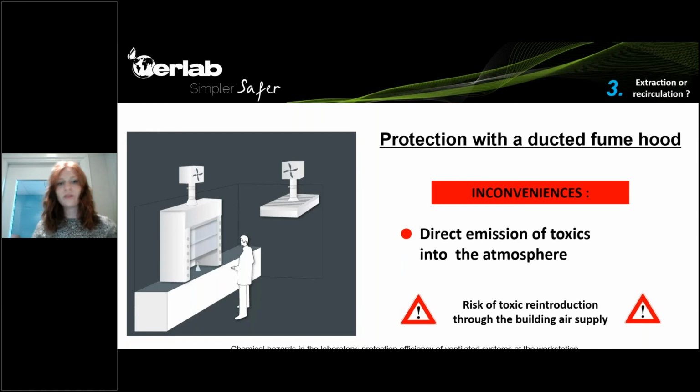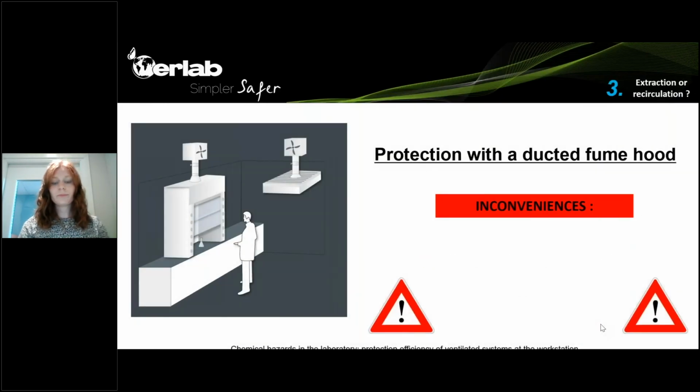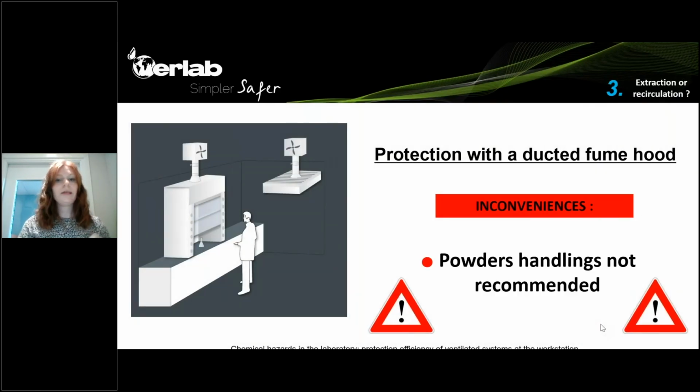As I was saying, some air needs to be introduced back into the building to make a compensation of the air. So there's a risk that these toxics are reintroduced later on through the building. Finally, powder handling is not really recommended under a ducted fume hood.